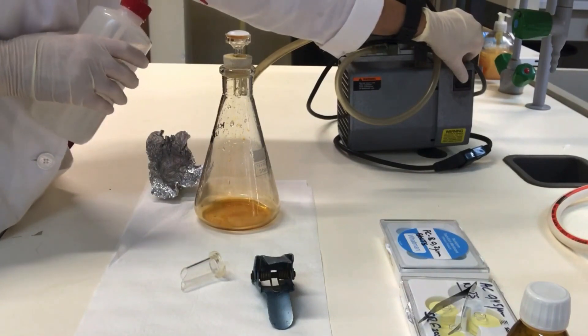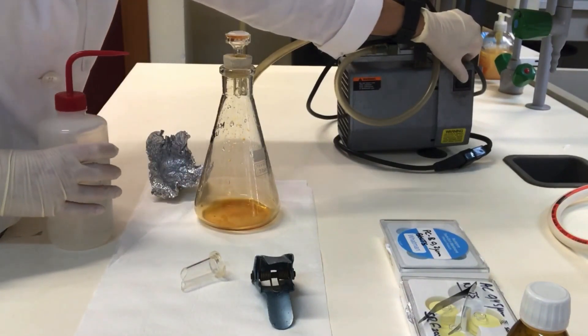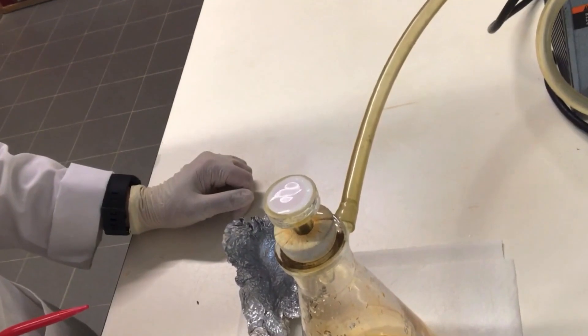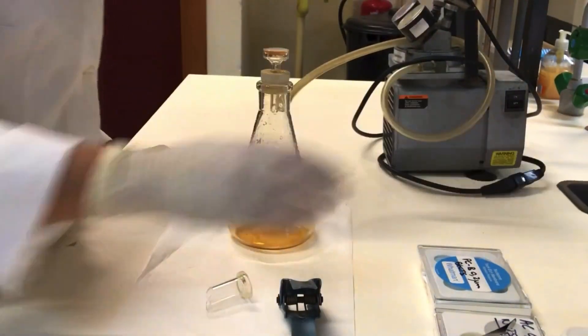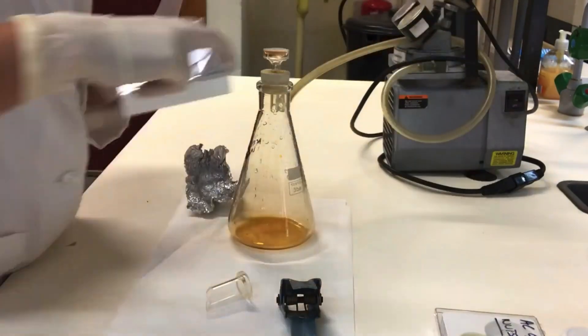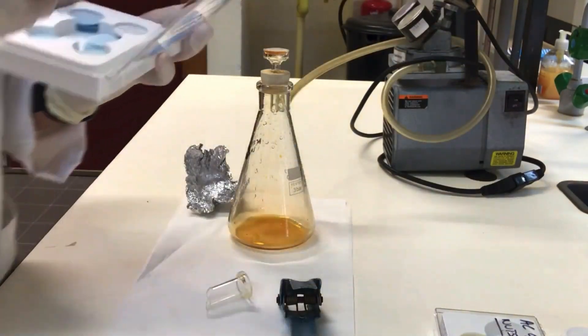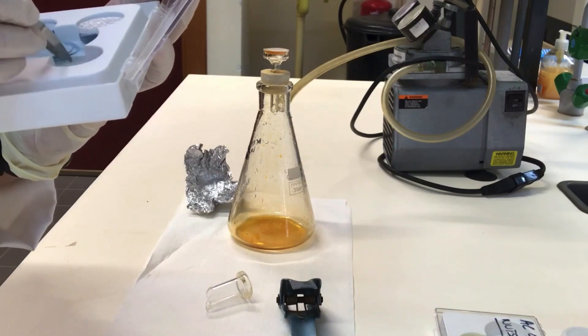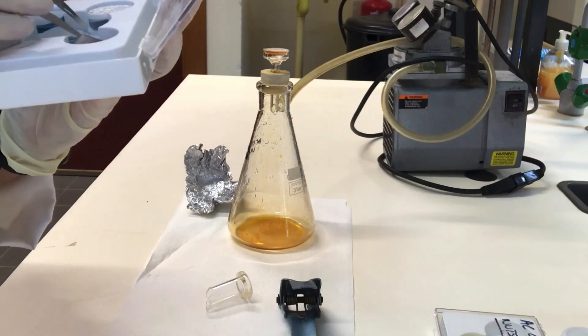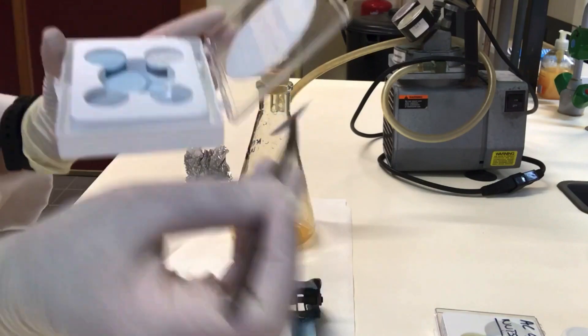Turn on the pump. Then place the membrane filter on top of the wet backing filter with the shiny side up, and avoid air bubbles and wrinkles.